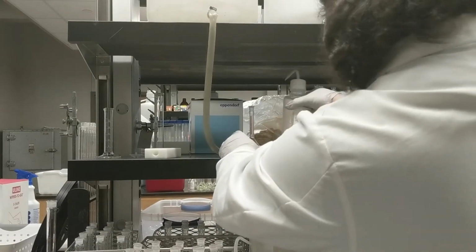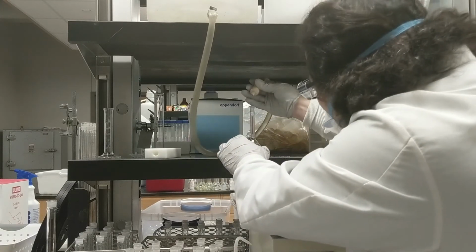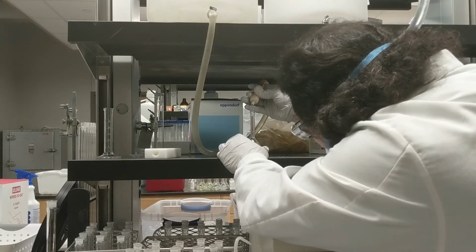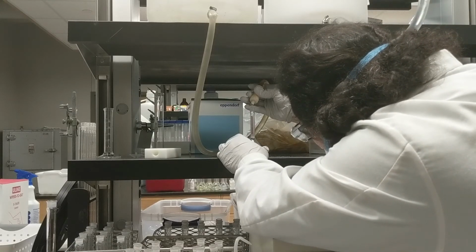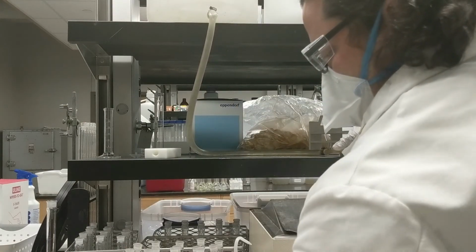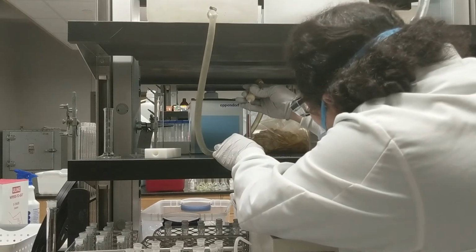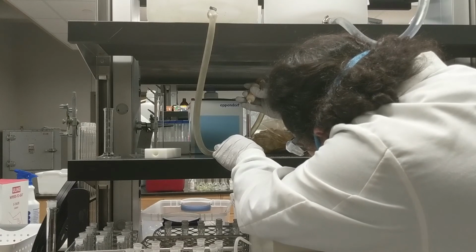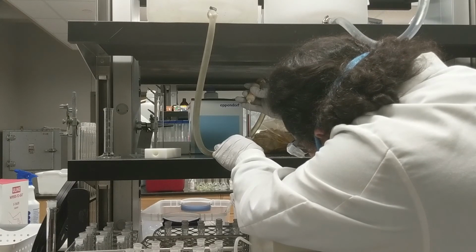Now that we have these samples poured up into their respective containers, it's time to bring them up to volume. We just use deionized water for this. We have a carboy that lets us do this pretty accurately, so the same rule applies as always does with volumetric flasks. Make sure you bring the water up to the line such that the bottom of the meniscus hits the line, and that rule applies also to the plastic centrifuge tube, but it's not quite as accurate.